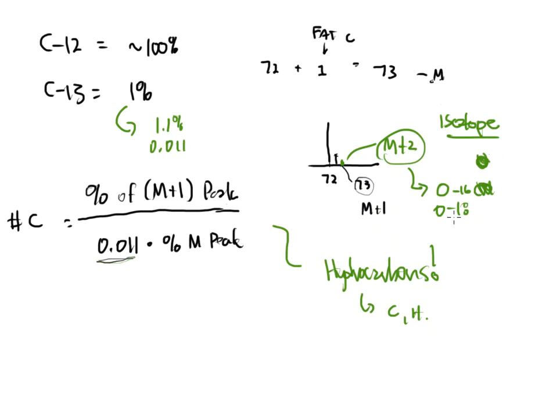So if oxygen is involved in a molecule that gets shot on a mass spectrometer, we do have a tendency to find a fat little oxygen on it, and we would see a signal at M+2, meaning that if the molecule did weigh 72 when you did a formula weight calculation, we could see a positive signal at 74. And that 74 line is coming from the fact that this thing has maybe an oxygen involved.